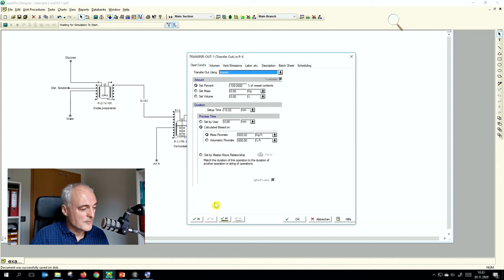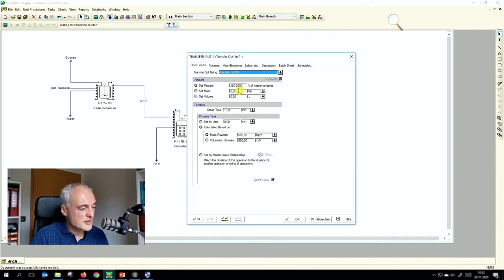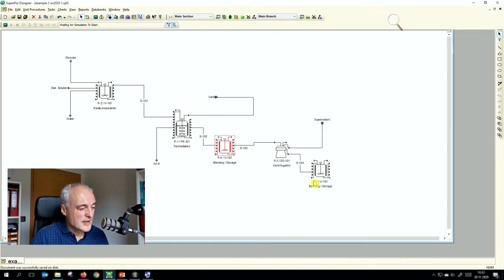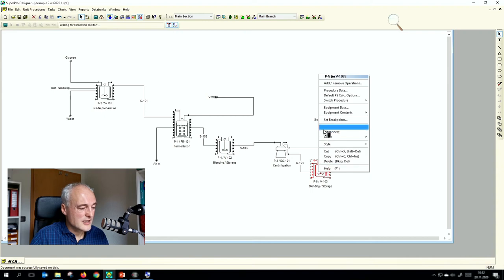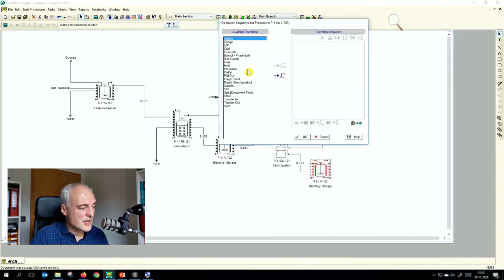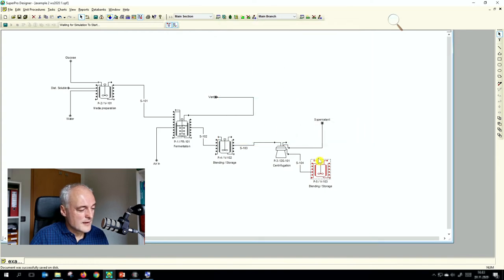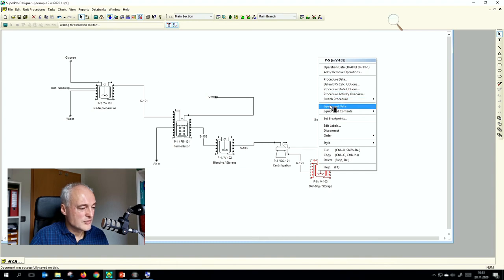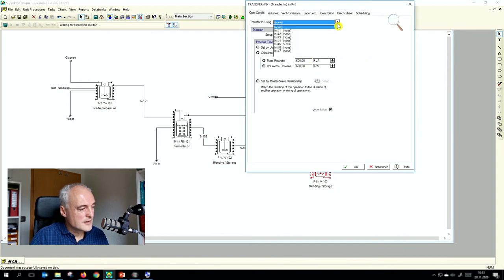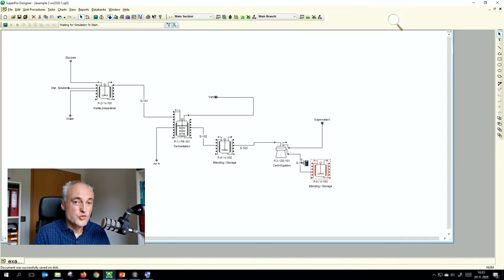Transfer out is initialized and connected. For the last blending storage tank, we add just a transfer in operation and initialize it with stream 104. Now all operations are doing what they should and all streams are correctly connected.